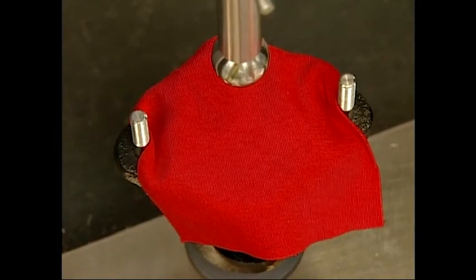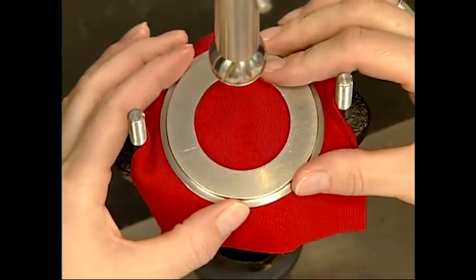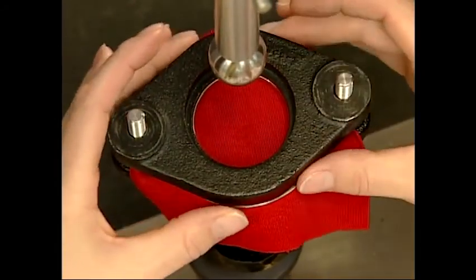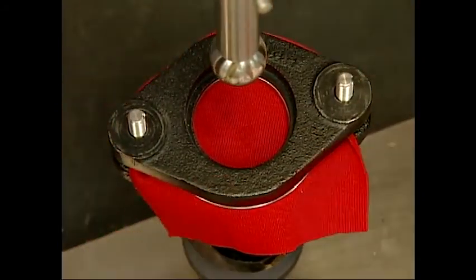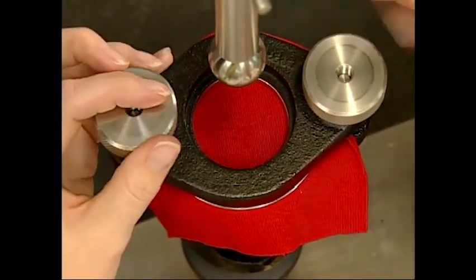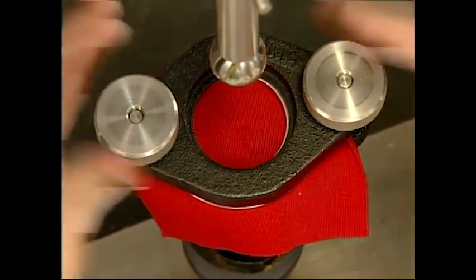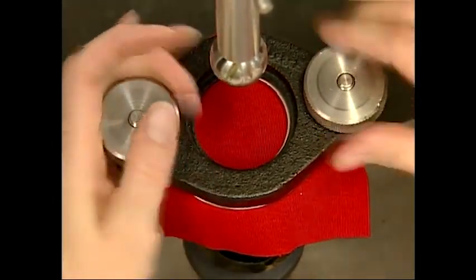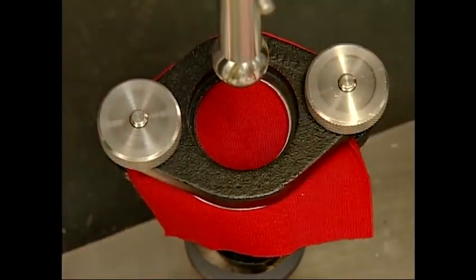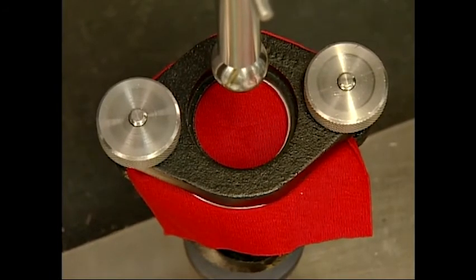Specimens are placed in a ring clamp assembly. Upon activation of the ball, the fabric is stretched by the actions of the ring clamp assembly and the ball.